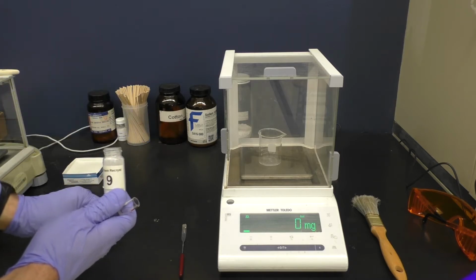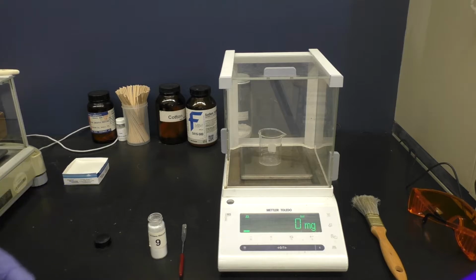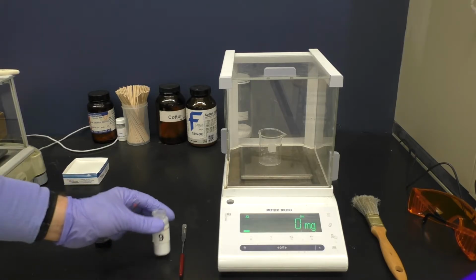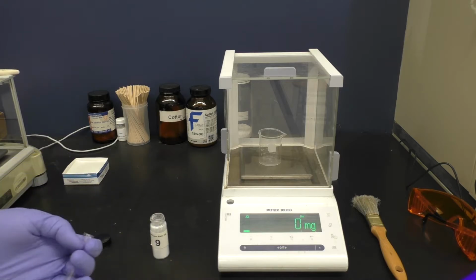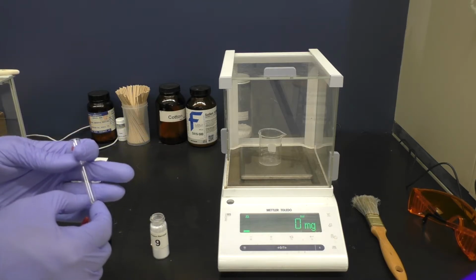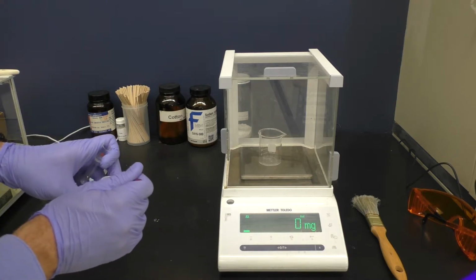And the exact amount that I need here is a little unclear. I don't need to take all of it. Certainly I couldn't do that. Here I'm just going to take 1 to 2 scoopfuls so that I have enough to work with, and then I'll get the mass for it to figure out exactly how much I've got.